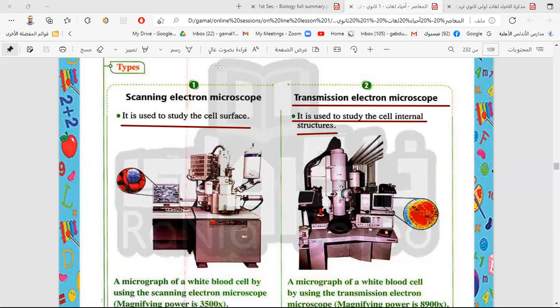فبيديني هنا بيكتشر كده، فوتو بتعبر عن مثلا دروب اوف بلاد by the scanning microscope وفيها white blood cell زي ما انت شايف الوايت بلاد سيل اهي. وهنا لما دخلت جواها بقى وعملت سكاننج بالترانسميشن مايكروسكوب شفت السيل اكثر وضوحا، دي الديتيلز الدقيقه جدا. يبقى واحد سكاننج بيسموه الناسح، وواحد ترانسميشن بيسموه المخترق او النافذ. ترانسميشن هنا معناها المخترق او النافذ.